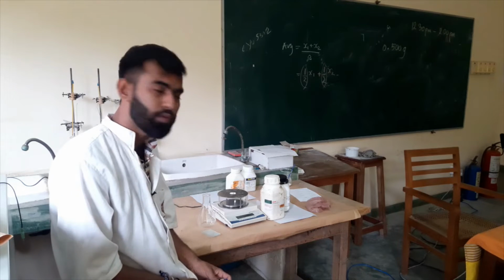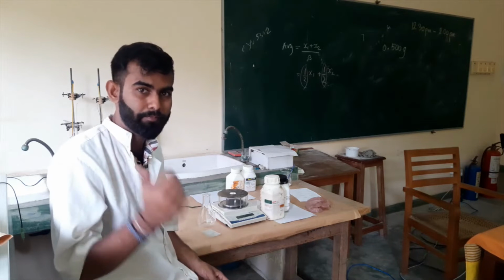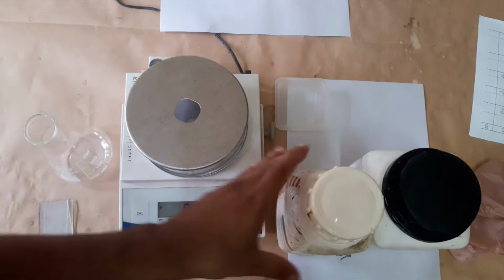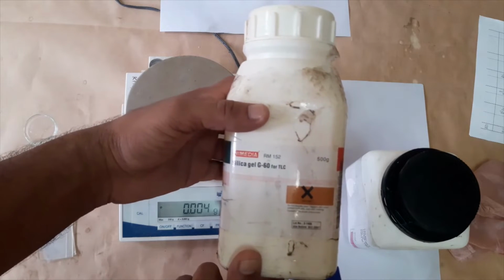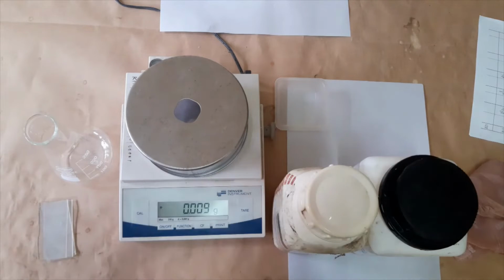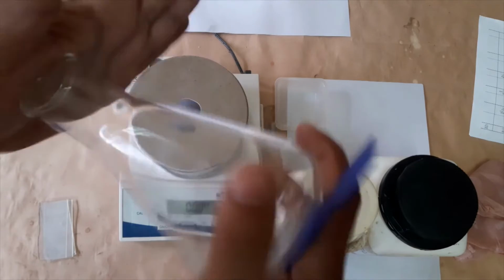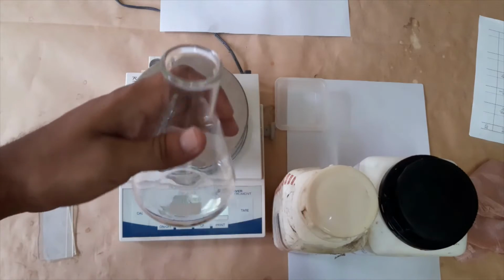Okay, now let's measure and mix. Come and look very carefully. Now you can see this silica gel G60, and here you have silica gel GF254. We will measure the same amount of each silica gel and add them into a conical flask, then cover the conical flask and mix it very well until we get a homogeneous mixture. After that we can add double the amount of water.